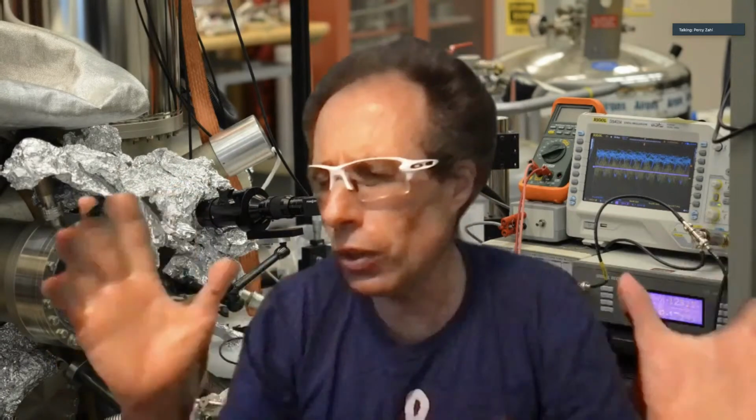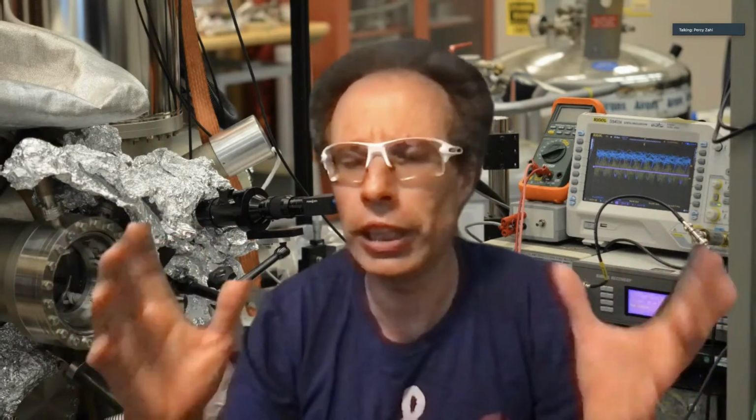Yeah, that is a typical question. I hear that a lot. The aluminum foil, well, in this case, is real aluminum foil, and I use it for multiple things. We need to bake this system to get the very, very high cleanness inside, and we need to cover windows with something that doesn't melt, just to insulate them thermally from radiation and shield a little bit. That's one thing. Aluminum foil is the cheapest thing you can do for that.